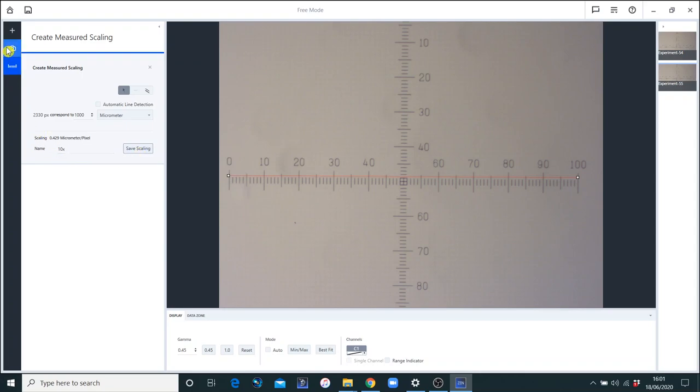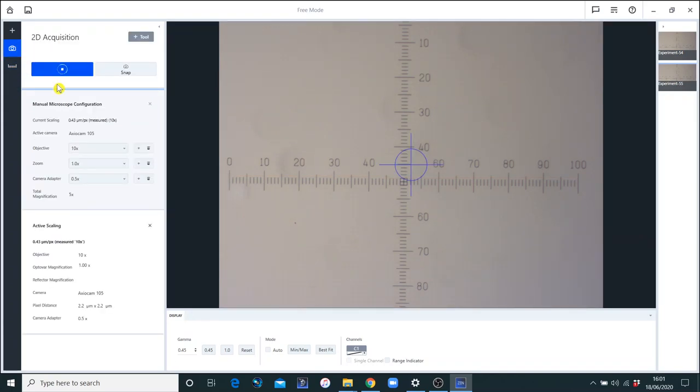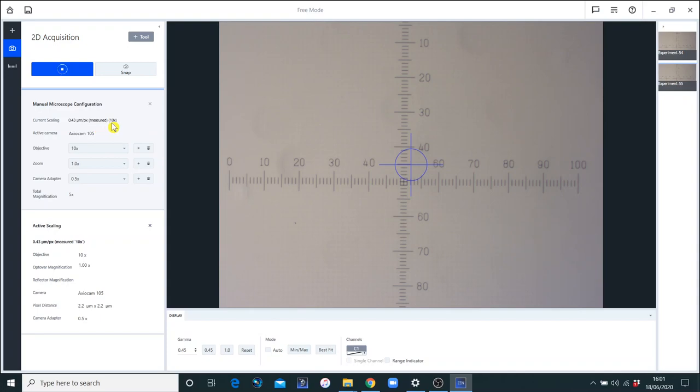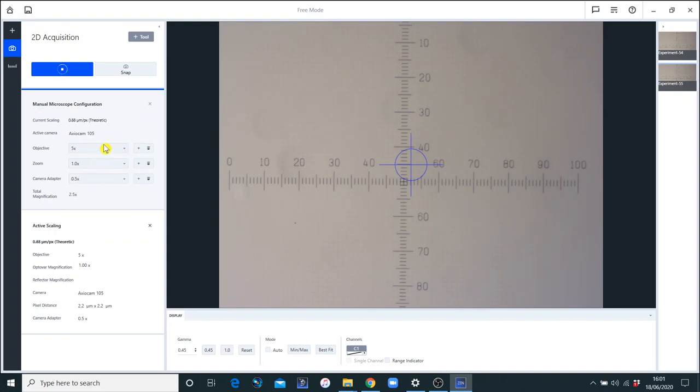And as long as you've used the name 10x, when we go back to the image now, we can see that we have a different number, slightly different number, a very slightly different number, but it says measured. So we've created a measured scale rather than a theoretical scale for the 10x objective. You can confirm that by looking at a different objective, and you see here it says theoretic. And here for 10, it's measured.